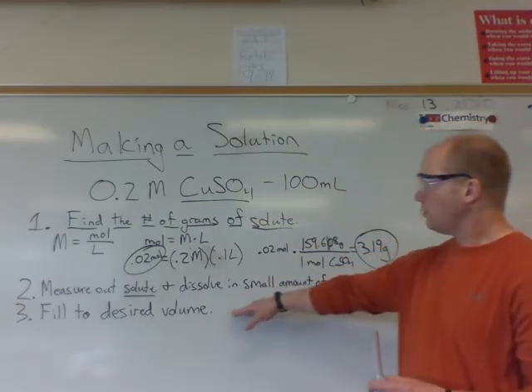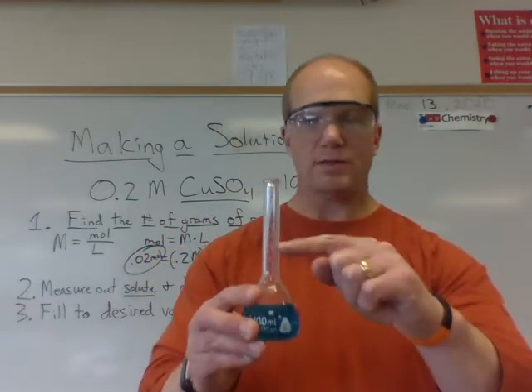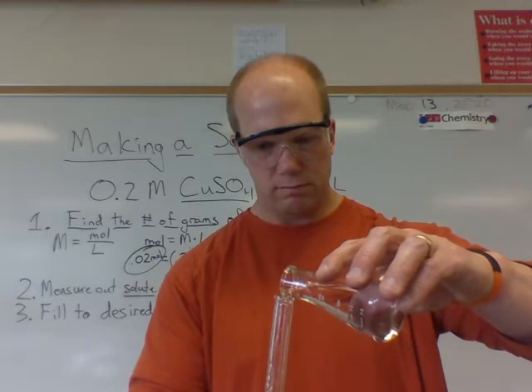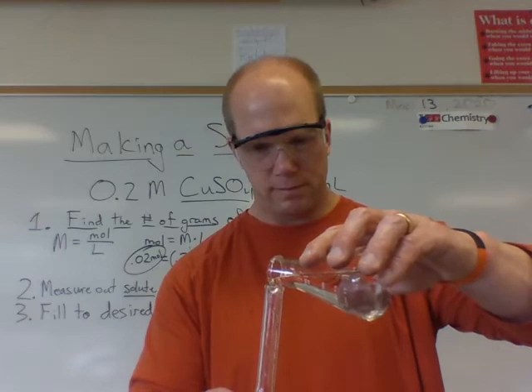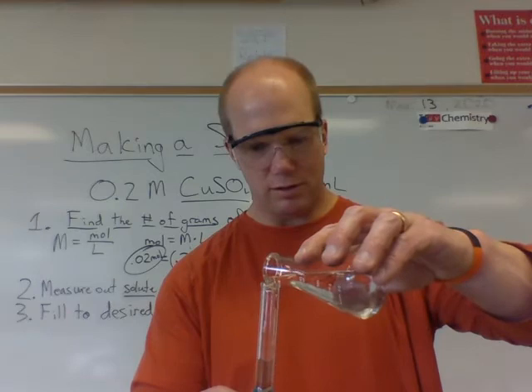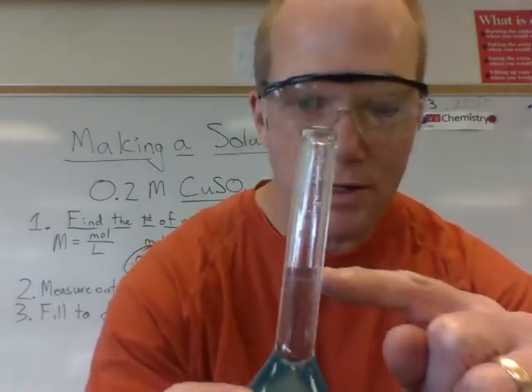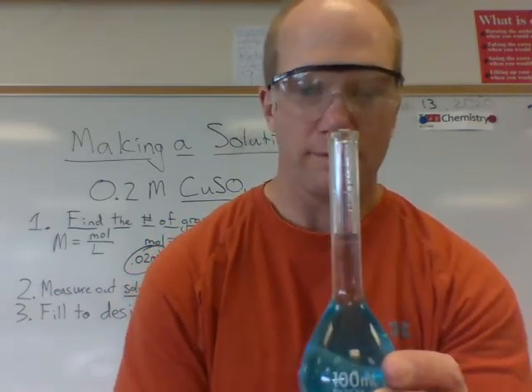So then the last thing is this. Once we've dissolved it, we're going to fill it to the desired volume. So all I'm going to do is take a little bit of water here and as best I can fill it up to this 100 milliliter mark on here. This can be tricky because once you hit the neck of this thing, it fills up really fast. And I went a little bit over, you guys. Well, that's the way it goes. It won't be too far off from my 0.2 molar.